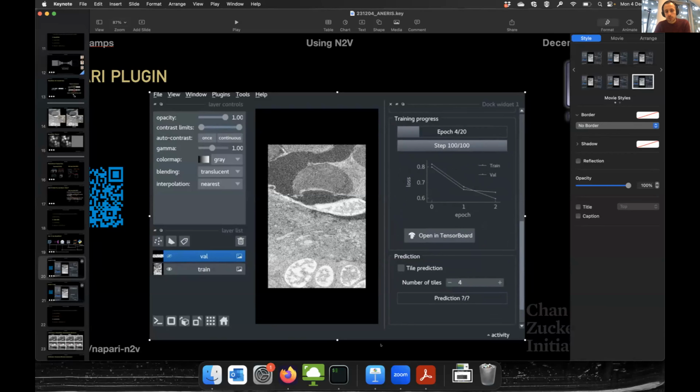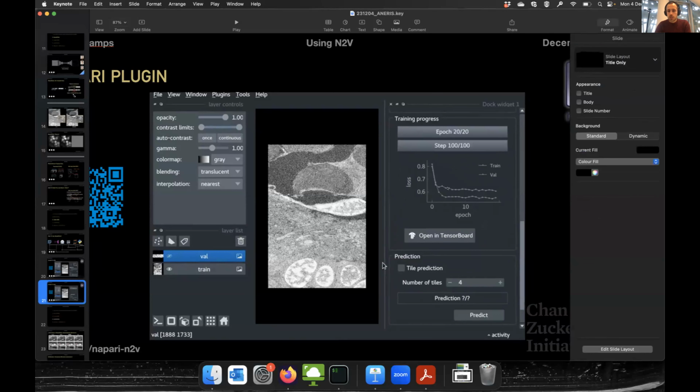Usually you expect Noise2Void to learn the structures in your image very rapidly, and then plateau for a long time. And on this plateau, you have to remember that we're training the network to guess what the noisy pixel value is, which it cannot do because the noise is independent. Therefore, the loss fluctuating but staying kind of stable just means that the network might still be learning to get closer to its estimate of the real value, but it will never go to zero, because zero would be the noisy pixel, and that's not what we want.